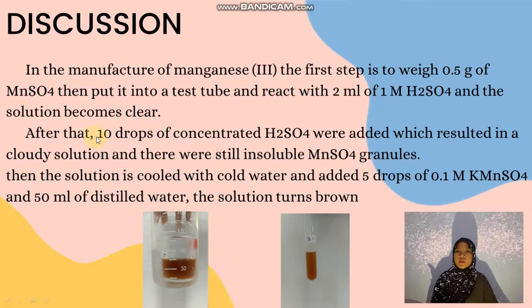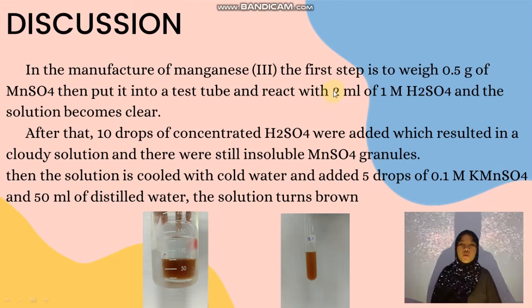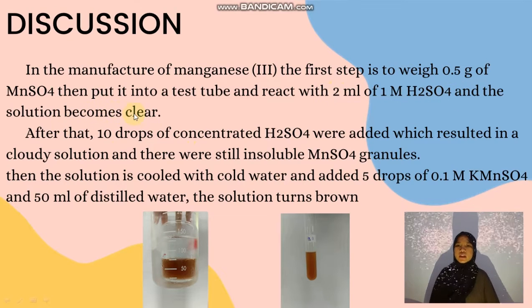Next, in the manufacture of manganese 3, the first step is to weigh 0.5 gram of MnSO4, then put into a test tube and react with 2 ml of 1 M H2SO4, and the solution becomes clear.